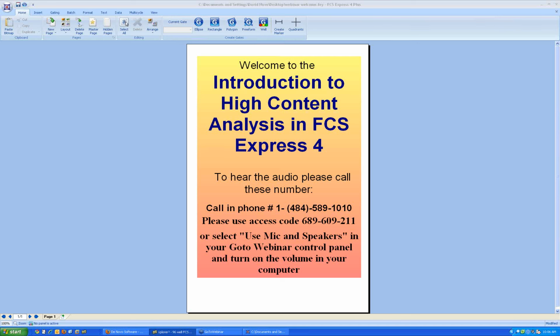If you have a HyperCyt, that's what I was trying to remember the name of, we can read that data as well. If you have an instrument that has a plate reader that we cannot seem to read the plates or that I haven't mentioned, please contact us. If it's any sort of standard flow cytometer that makes FCS files, we will add it to the formats that we are compatible with.